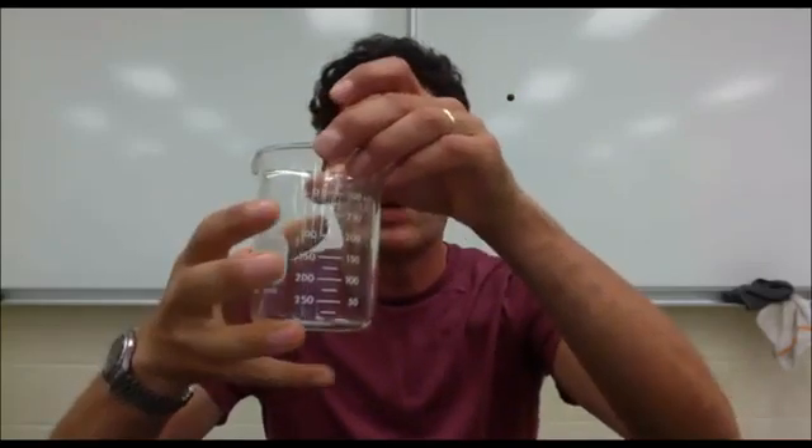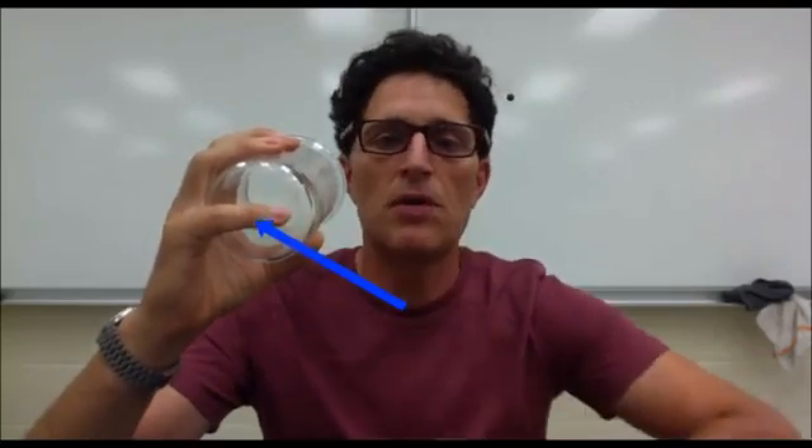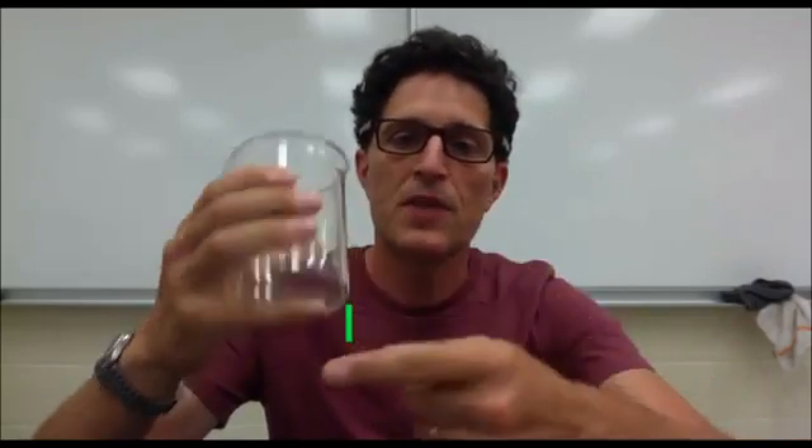We solve that problem by putting our pinky like this on the bottom of the beaker so that there are three points of contact: one, two, three.